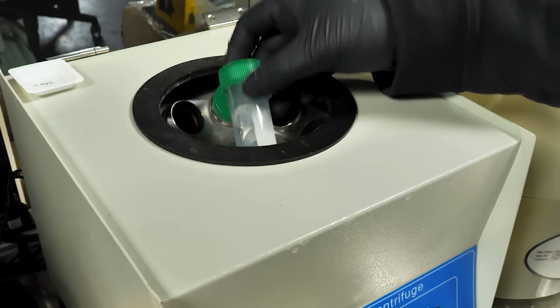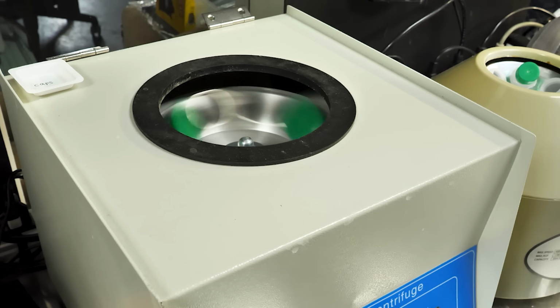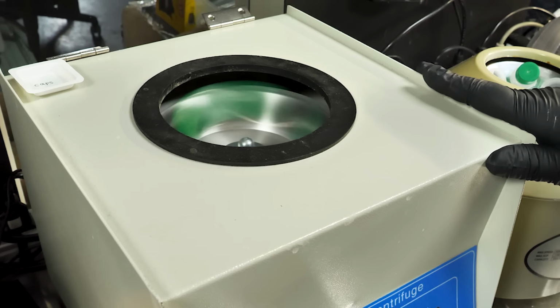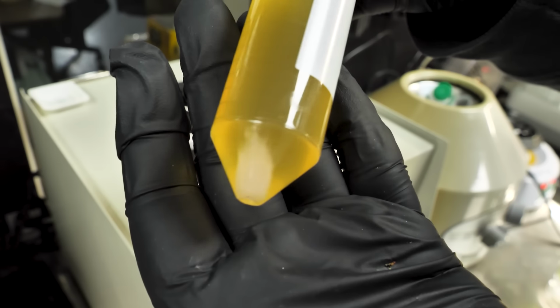Anyway, we take our E. coli solution and load it into our centrifuge with a matching dummy tube filled with the same amount of water on the opposite side to it. This way, the centrifuge won't explode. This will form a pellet of cells at the bottom of the tube.